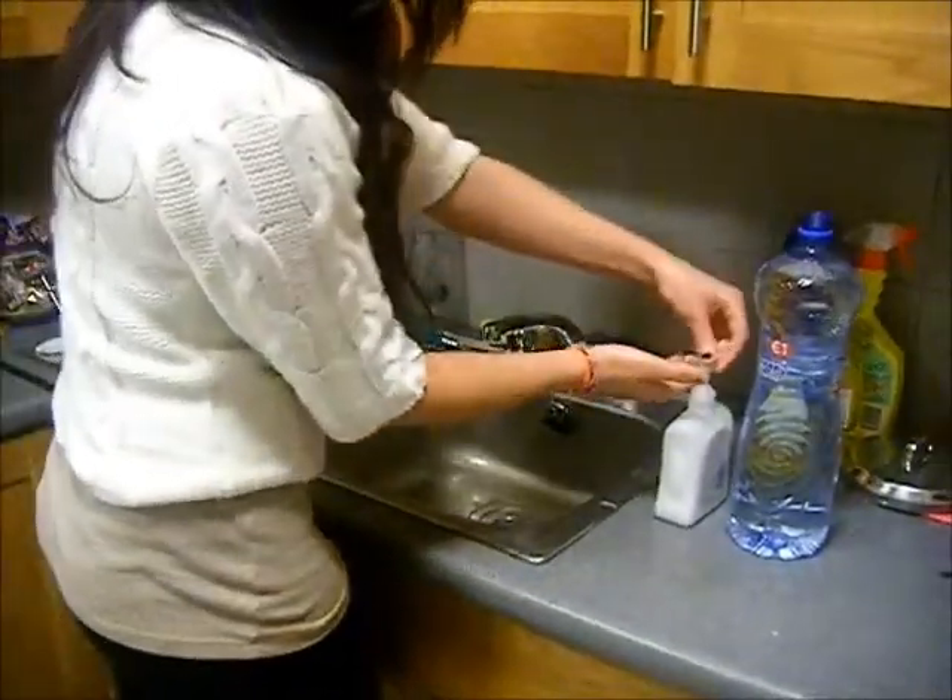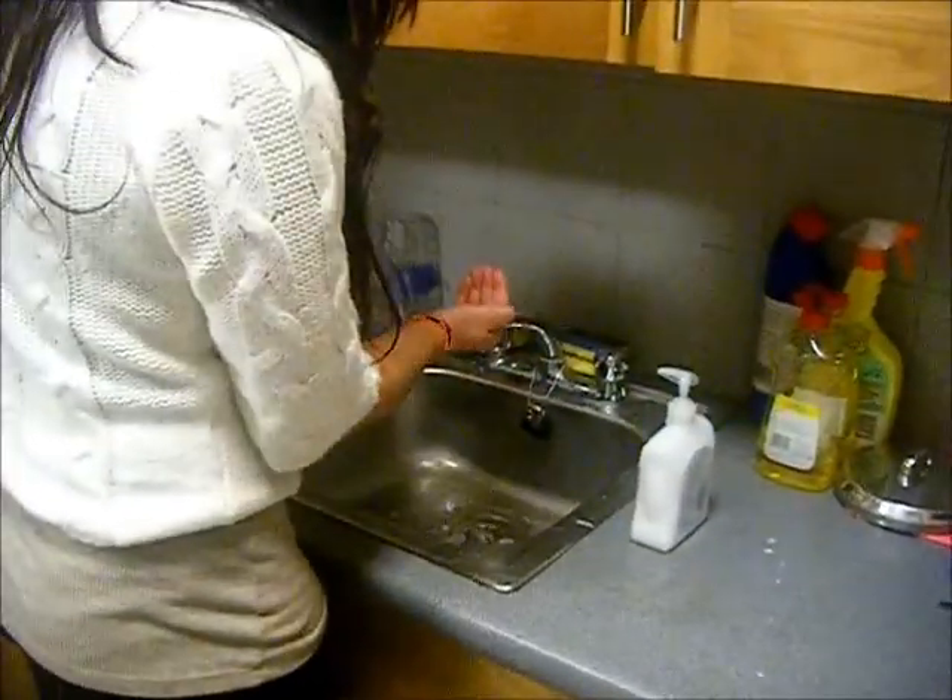The second sample of water is from bottled water. Notice how much more of a lather is formed with this water.